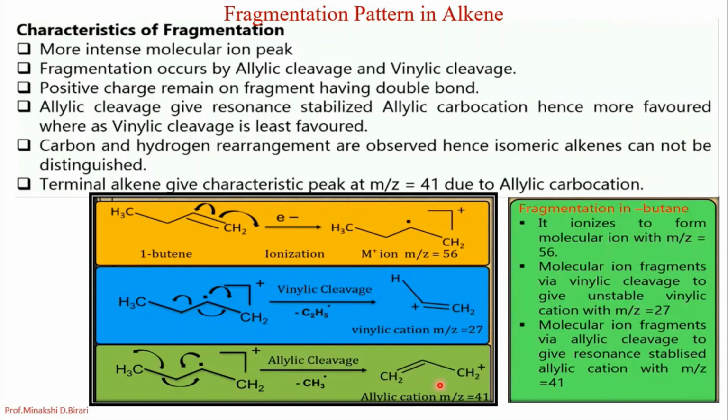When we observe the vinylic cleavage, it also occurs by homolytic cleavage, but it is less stable as compared to allylic cation, because allylic cation will undergo the resonance stabilization and forms the most stable carbocation.